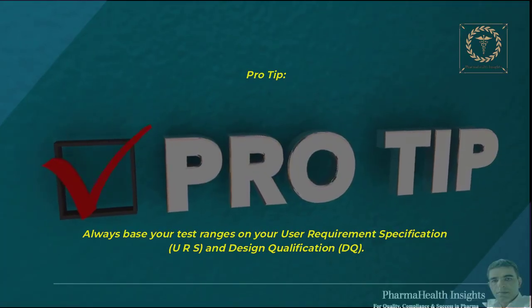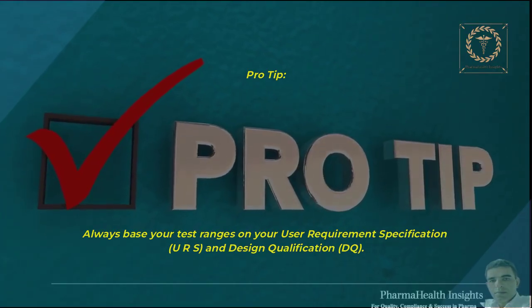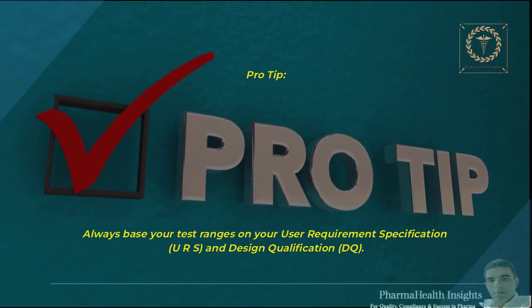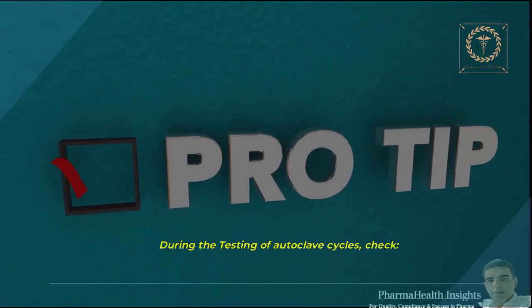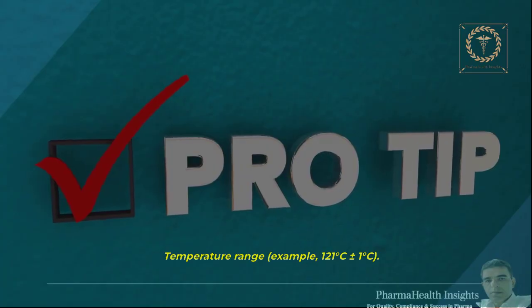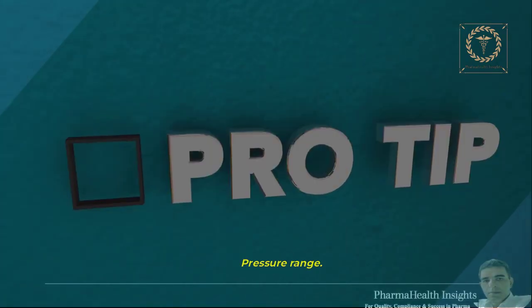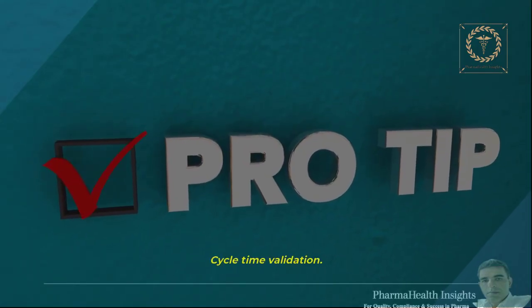Pro tip: always base your test ranges on your user requirement specification, URS, and design qualification, DQ. For example, during the testing of autoclave cycles, check temperature range, example, 121 degrees Celsius plus or minus 1 degree Celsius, pressure range, cycle time validation.